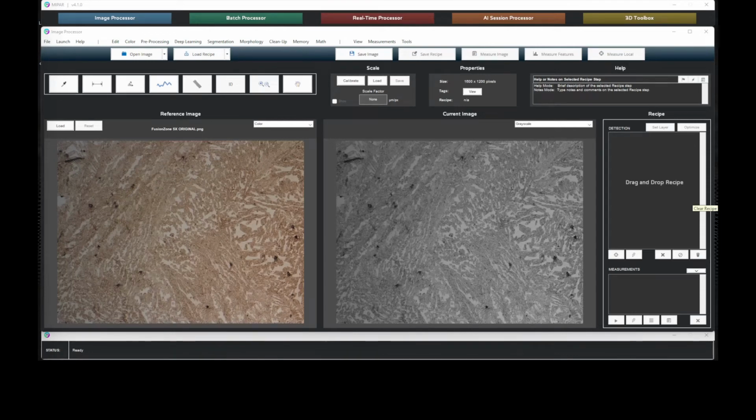When performing characterization of steel phases, optical image data can pose challenges due to sample preparation and imaging variation. In the past, this analysis would be done manually, using a technique like point counting. This manual process was extremely time-consuming and has reduced statistical power when compared to modern automated techniques.